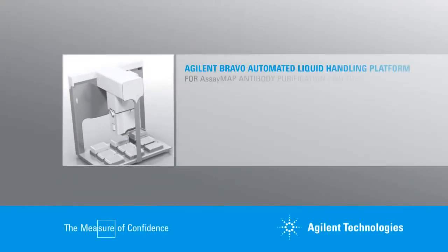Agilent Technologies introduces the Agilent Bravo with AssayMap technology, an automated, high-throughput solution for protein purification designed to accelerate your biologics discovery and development.